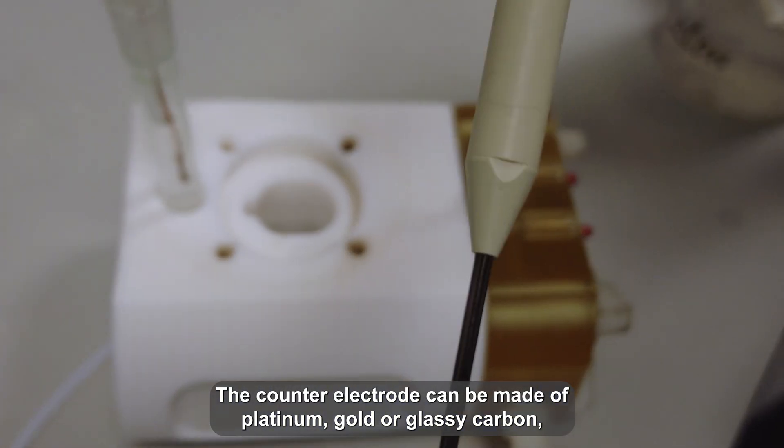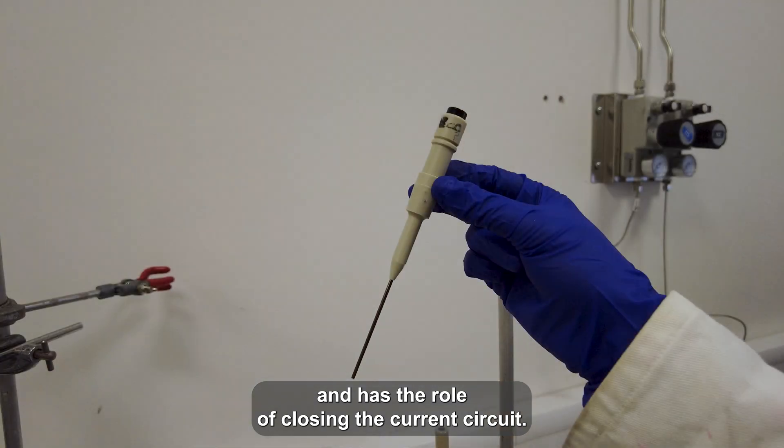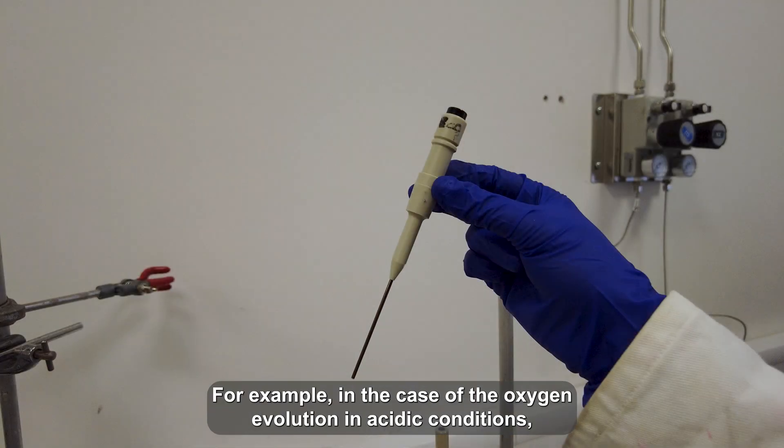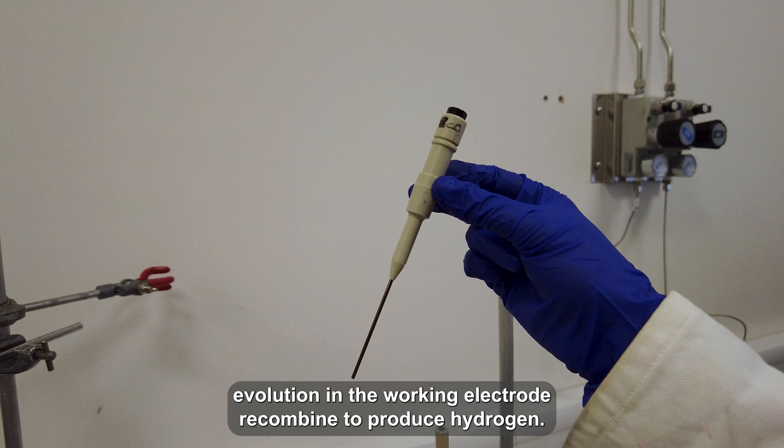The counter electrode can be made of platinum, gold, or glassy carbon, and has the role of closing the current circuit. For example, in the case of oxygen evolution in acidic conditions, the counter electrode is where the protons and electrons produced by oxygen evolution in the working electrode recombine to produce hydrogen.